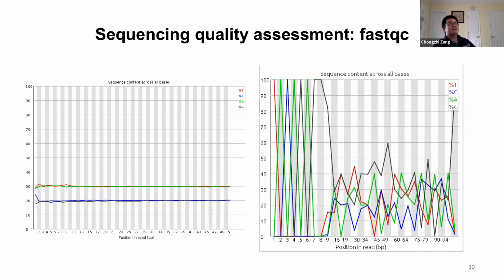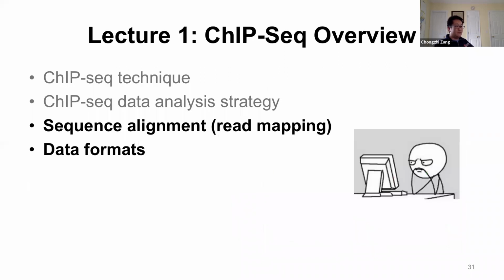Even if you include the barcode in one sequencing run, you should include more than one barcode, right? Not only the same barcode, right? Yes. Thank you. Yeah, if the entire flow cell or sequencing run contains only one barcode, that still likely means the sequencing failed, because you don't get multiple barcode information.